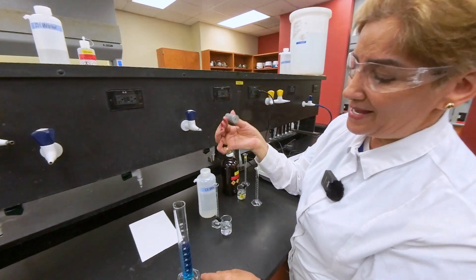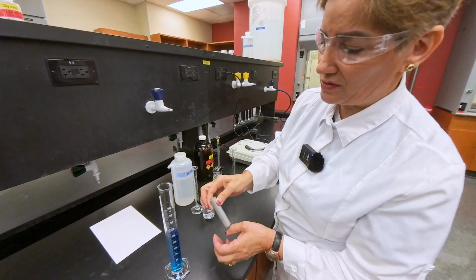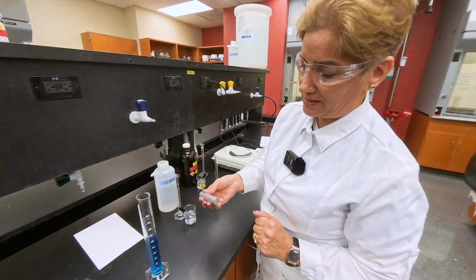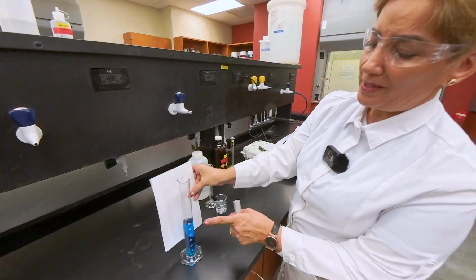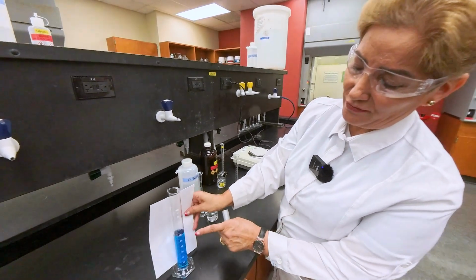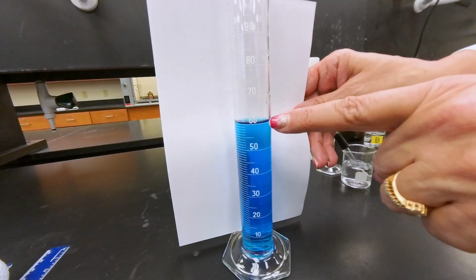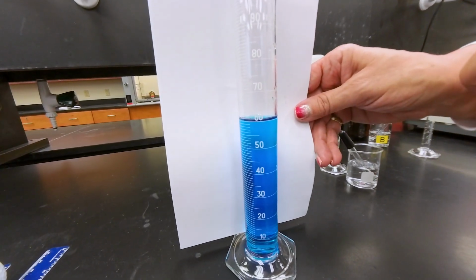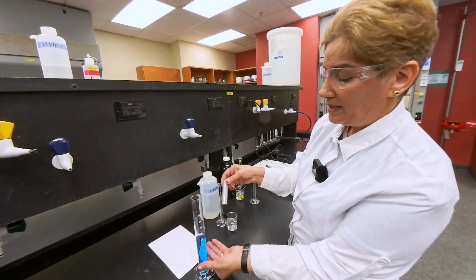Because this object is heavy, I want to make sure I show you how to slide it down the side so the water doesn't splash. We are going to place a certain amount of water, and it doesn't have to be an exact number, but we are using this volume here, and use the close-up to record that number exactly as it is.